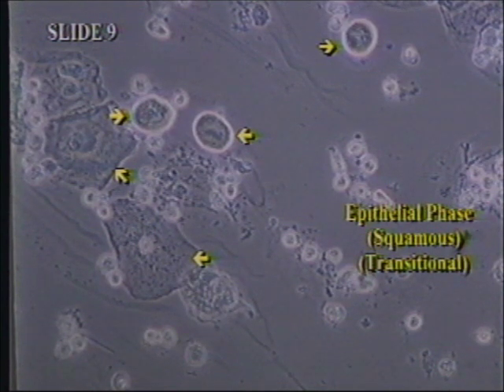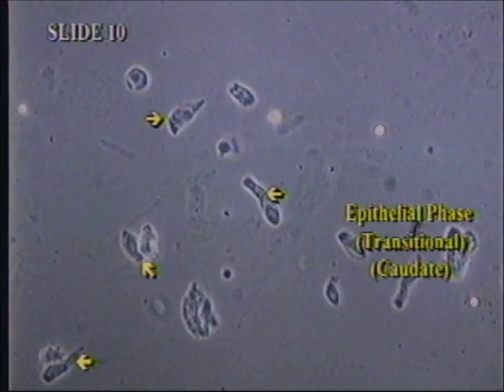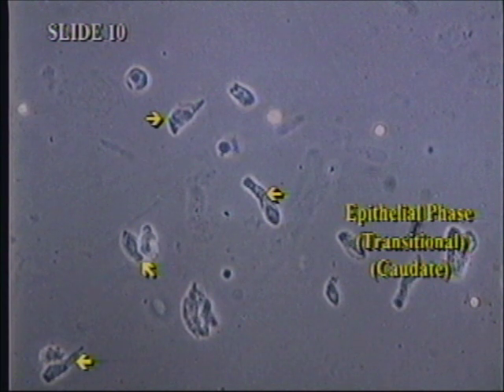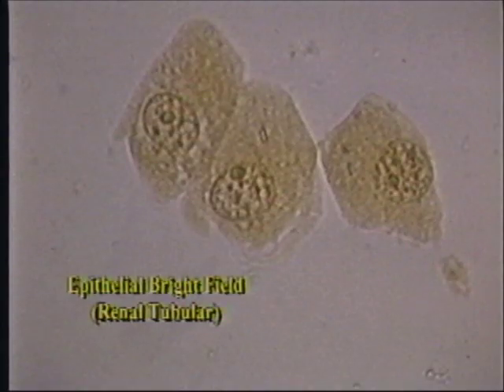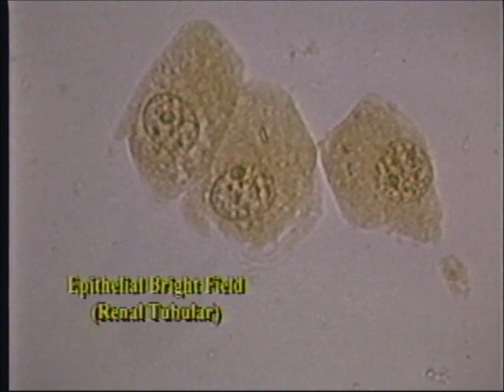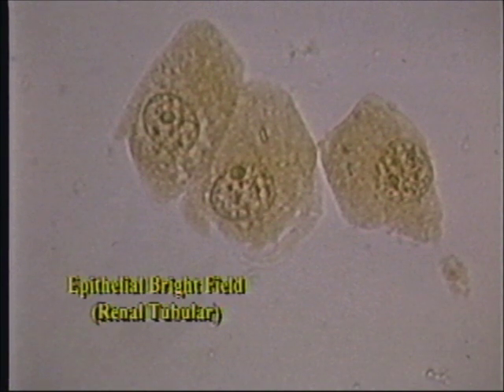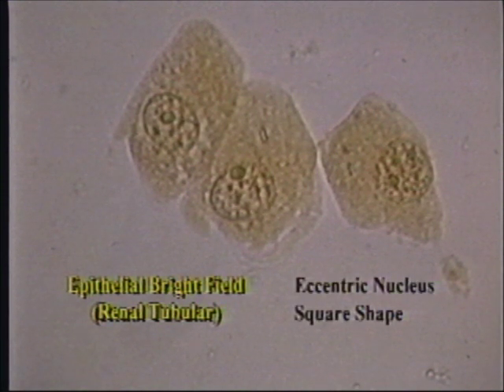This phase view shows squamous and transitional epithelial cells in combination — the large squamous epithelial cells and the transitional epithelial cells, which are round, significantly smaller, with a centrally placed nucleus. Another type of transitional epithelial cell are these caudate-shaped cells seen under phase; they have the same significance as other transitional cells but come from a different part of the urinary tract. The third type to be differentiated is the renal tubular cell. These cells are pretty much the same size as transitional cells but have an eccentric, obvious nucleus and a square rather than round shape.